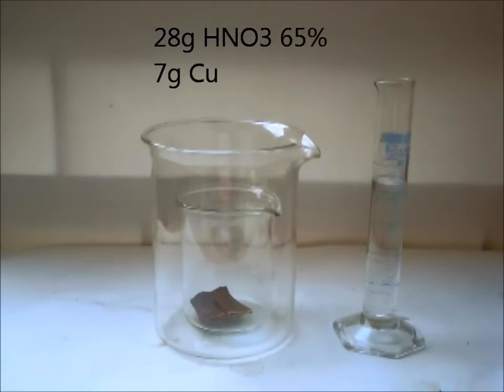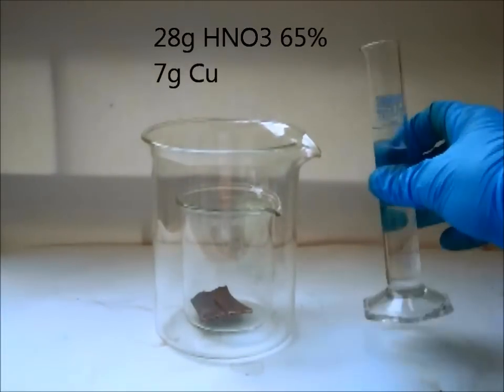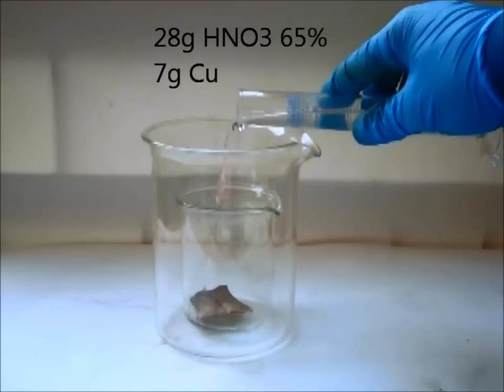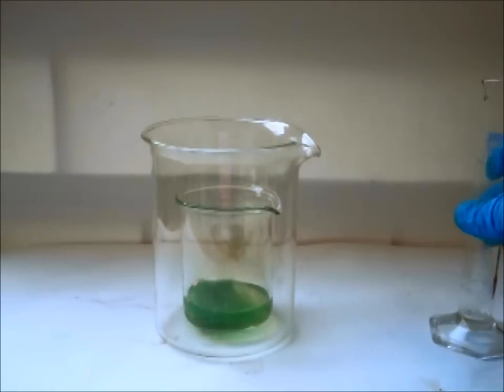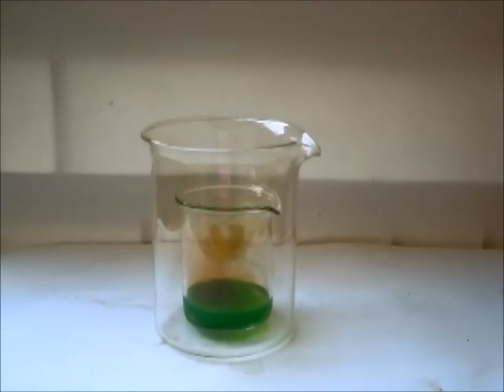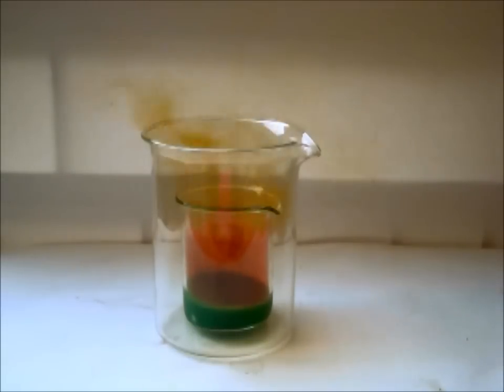To start, add 28 grams of 65% nitric acid to the glass beaker containing 7 grams of pure copper. Do not use plastic jars. The reaction starts immediately. The solution, as you can see, turns green, and nitrogen monoxide combines with the oxygen in the air to give the red nitrogen dioxide.